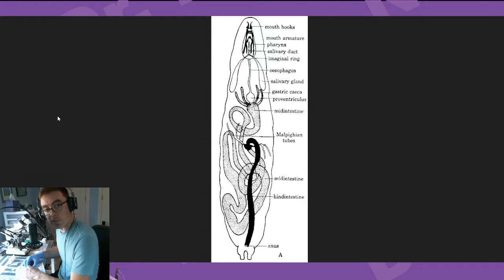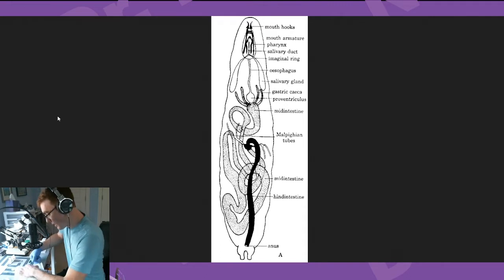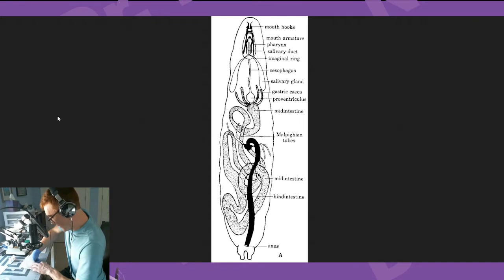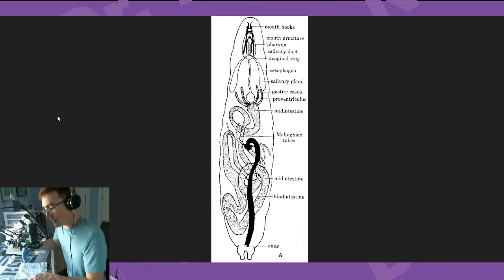So you're not going to be able to see what I'm doing, but that's okay. So I'm just adding the cover slip on, and now with some even pressure, I am going to push down with my thumb as hard as I can to break open the cells and pop out the DNA and get it to spread as much as possible. So I'm actually pushing down with as much force as I can for about 10 to 20 seconds. Okay, we'll see if that worked.